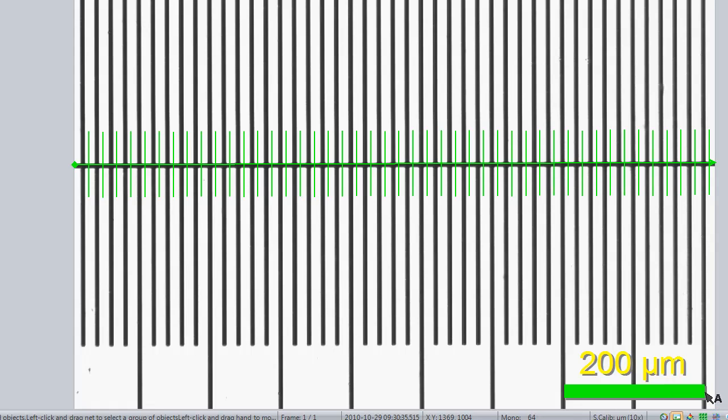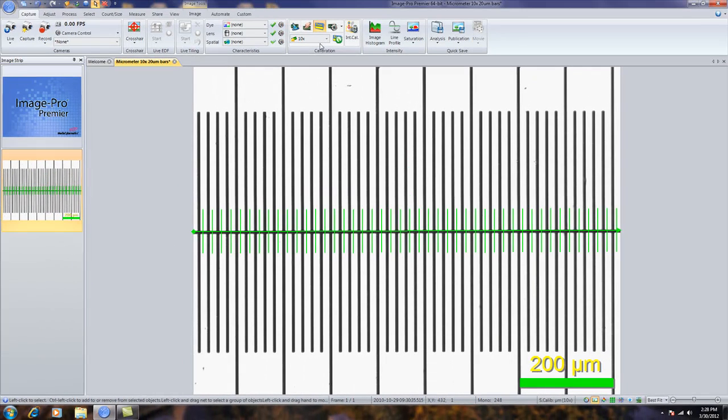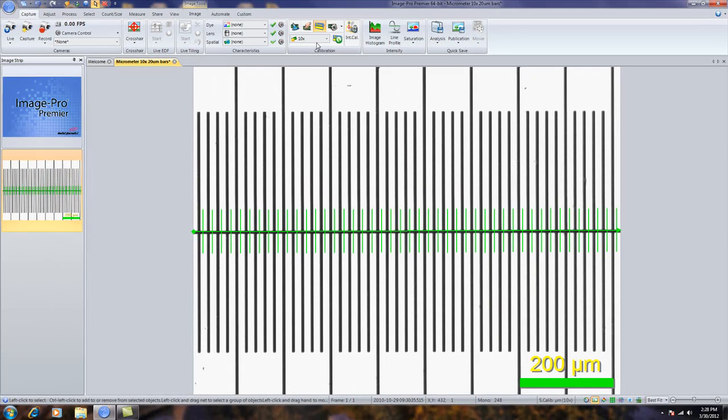This is just a nice visualization showing you that the correct calibration has been applied. You'll also notice that in the calibration group, it automatically makes that the current calibration.